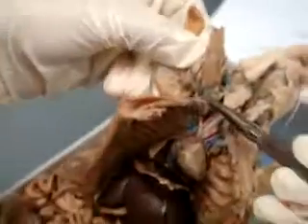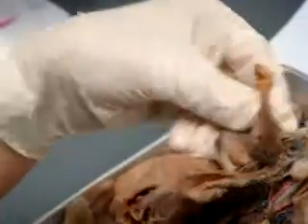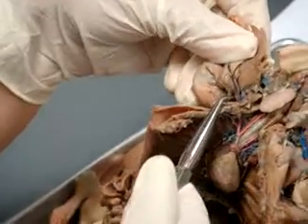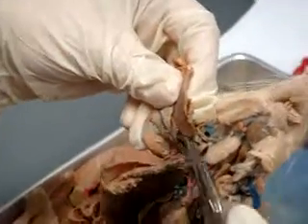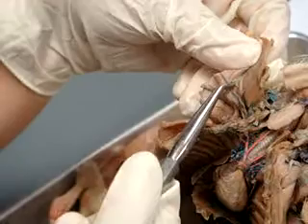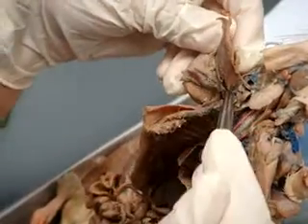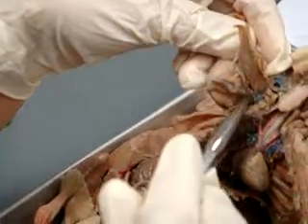Okay. See how it splits again? Can you see how it splits? D-shaped again? It's because it's splitting into two different things again. Whoops, I just broke your arm even worse. The one that's up here, you can follow that and see how it comes down right there. It follows the inside muscle in there. That's your lateral thoracic artery.